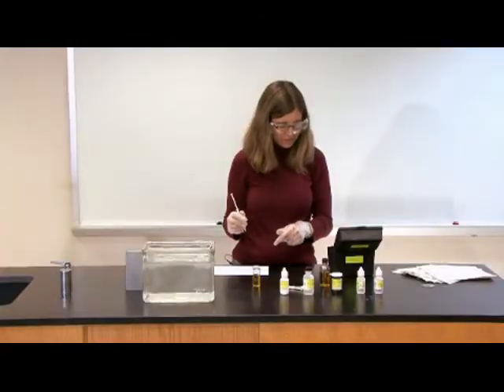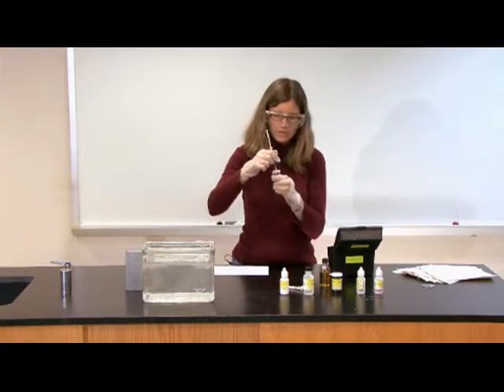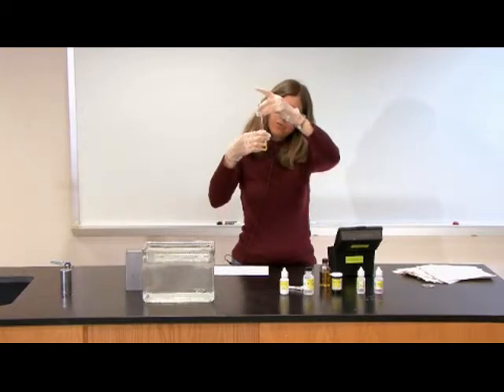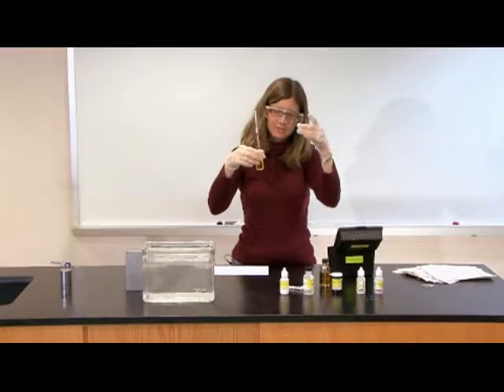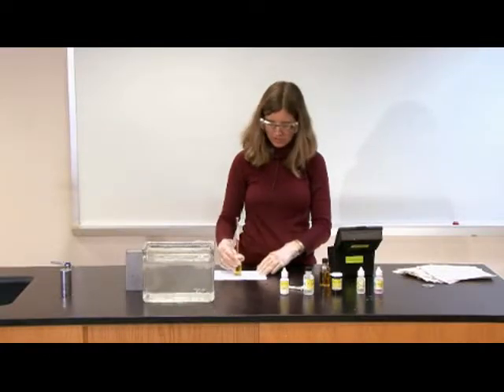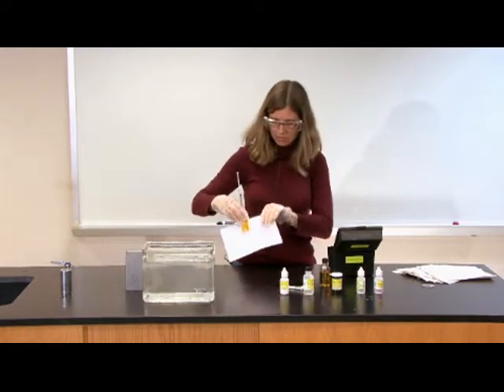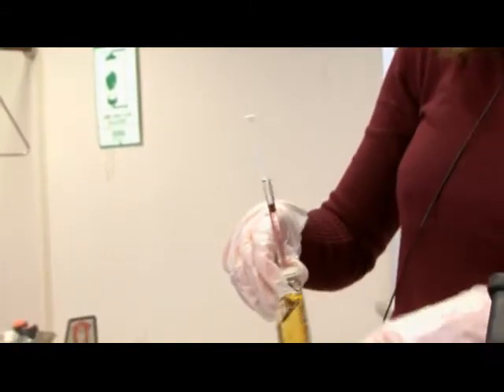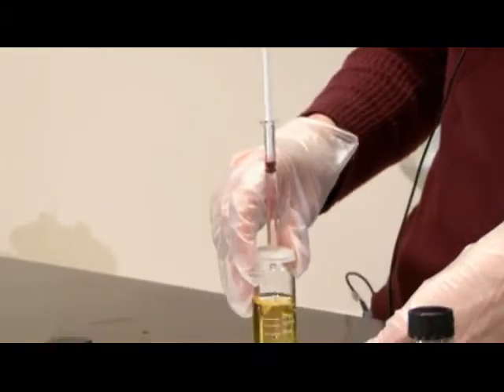And now I'm ready to do my titration. So I'm going to add one drop at a time. Again, this is challenging for students to be patient enough to do one drop at a time, but you want to add one drop at a time. And then swirl after each addition. And what you're looking for is a color change until it becomes very faint yellow. So it's kind of helpful to hold your sample against a piece of white paper to decide when it's very faint yellow. The change happens pretty quickly. So that's why it's helpful to swirl after each drop is added.